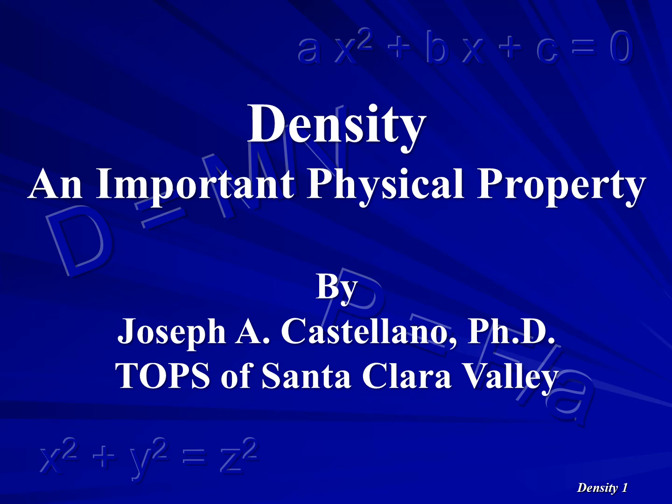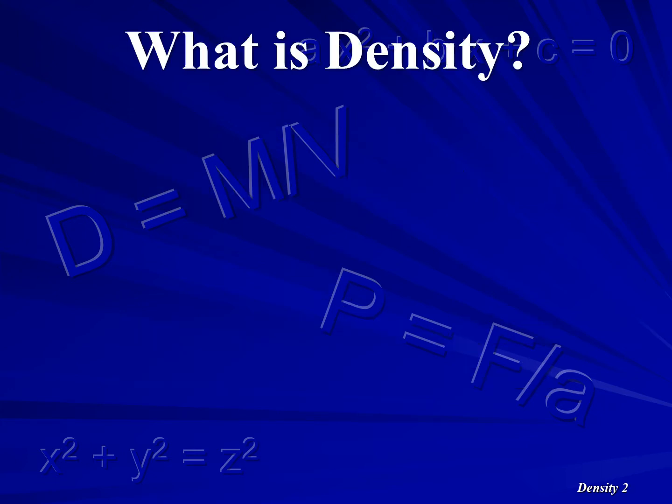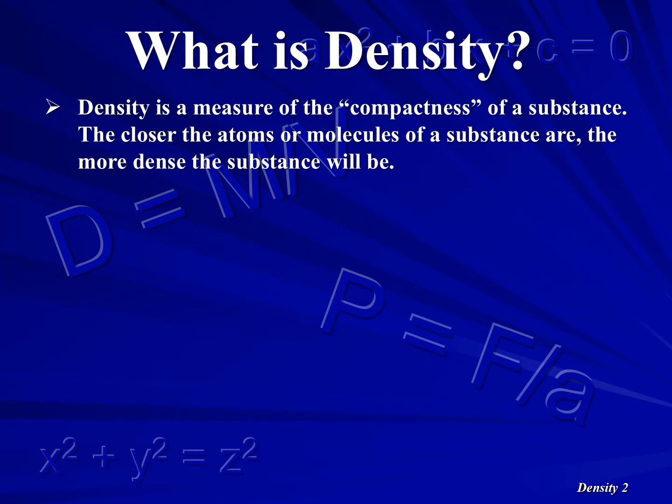Density is an important physical property. This presentation will show you how to measure the density of various materials of different shapes. Density is a measure of the compactness of a substance. The closer the atoms or molecules of a substance are, the more dense the substance will be.